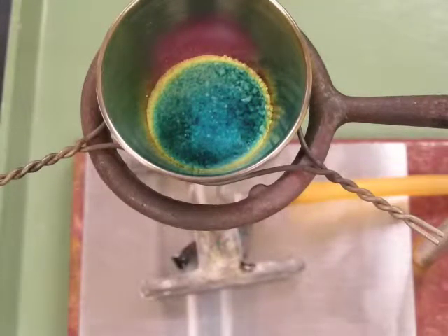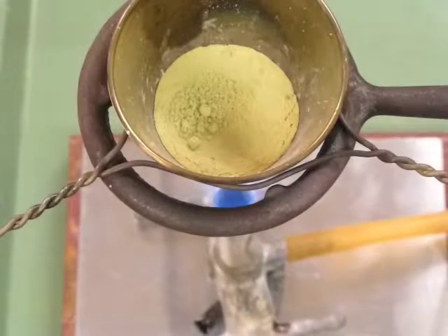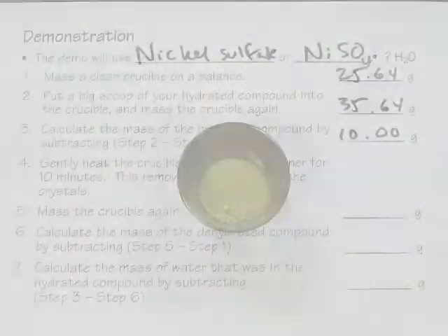So we'll let this one heat for a while until it completely loses all of its water, and then we'll weigh it again. Okay, you can see that the color has pretty much completely changed because the water in this substance has all evaporated, leaving behind the dehydrated compound nickel sulfate. The next thing I'll do is I'll reweigh this, and then we'll do some calculations.